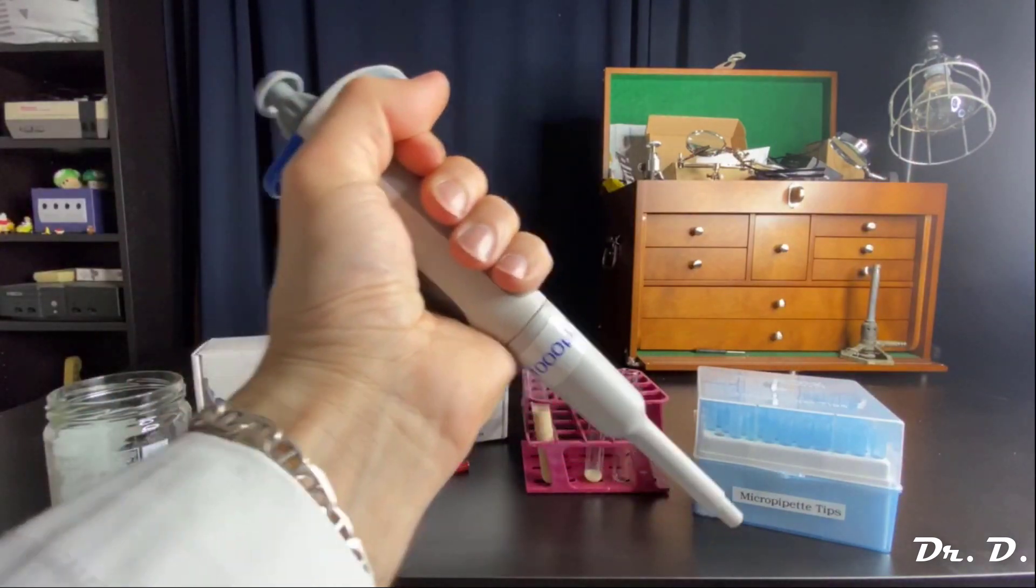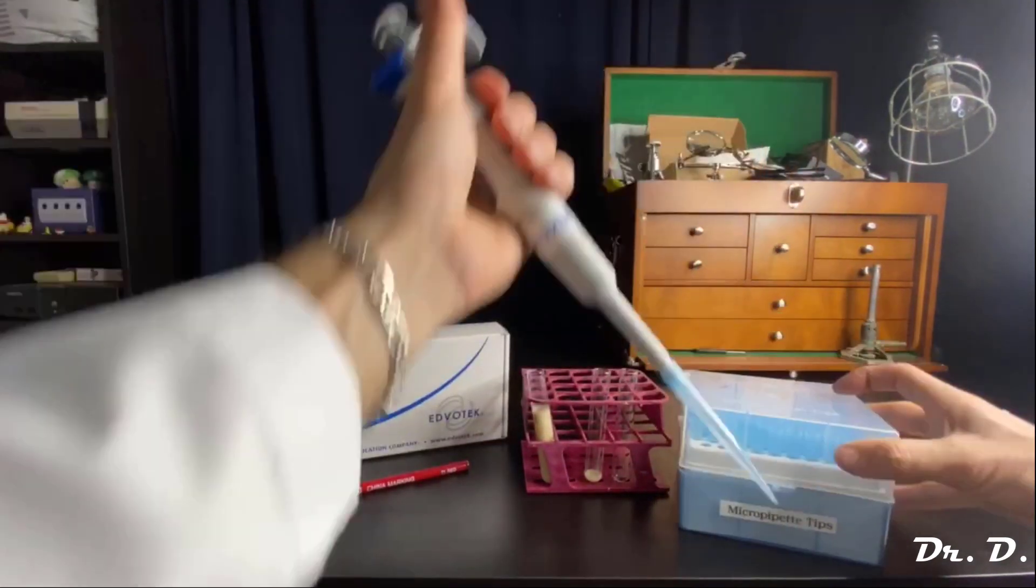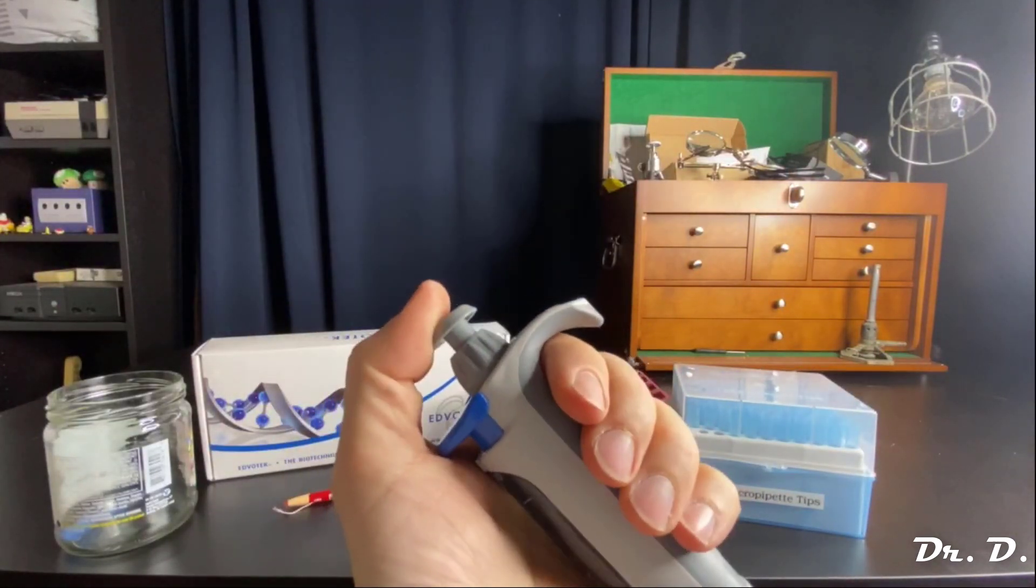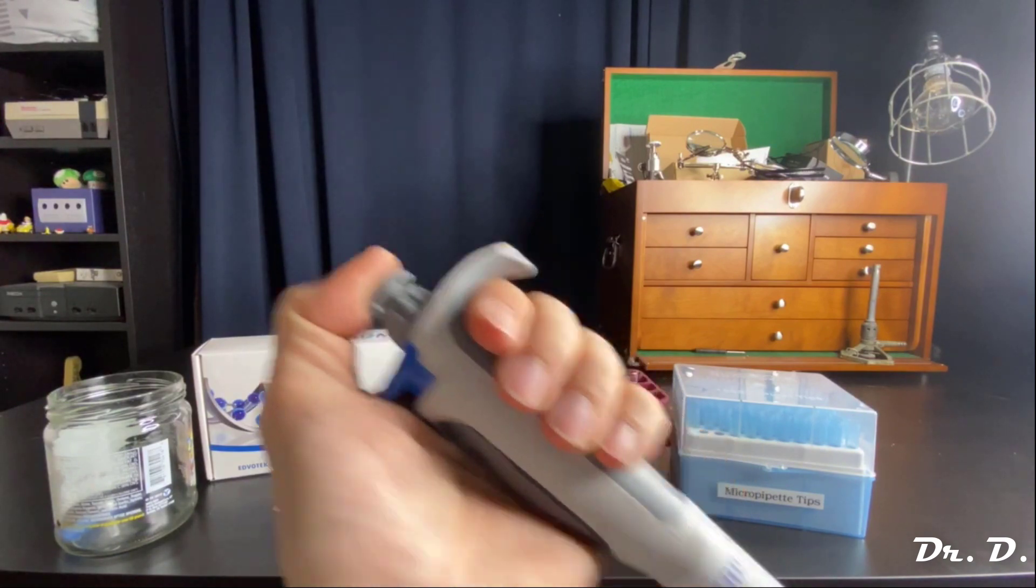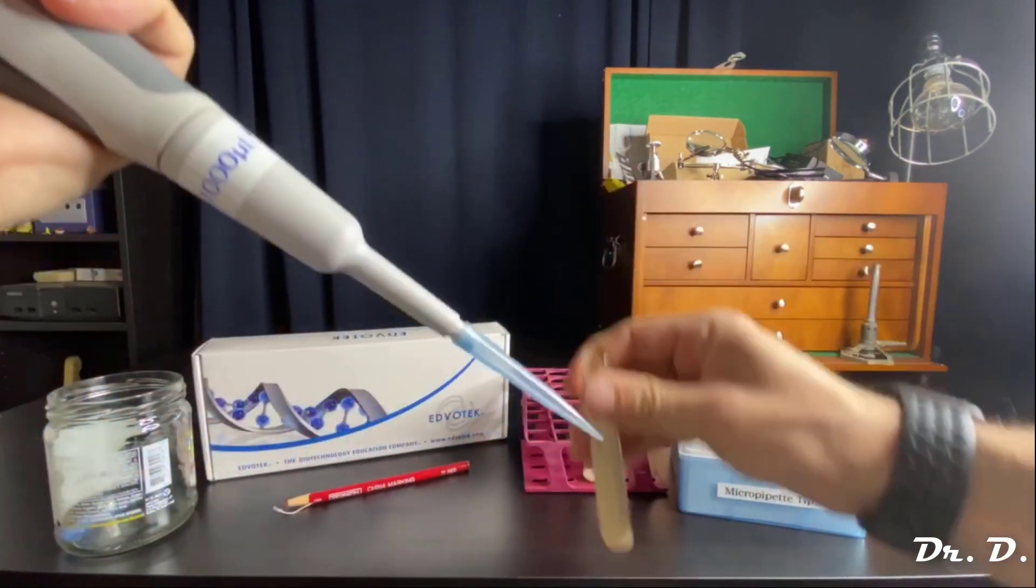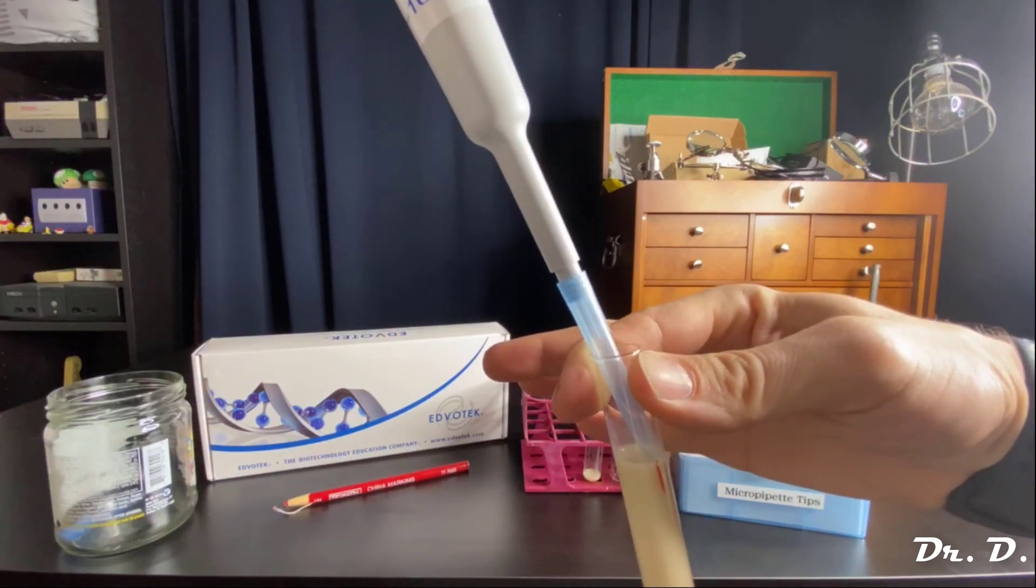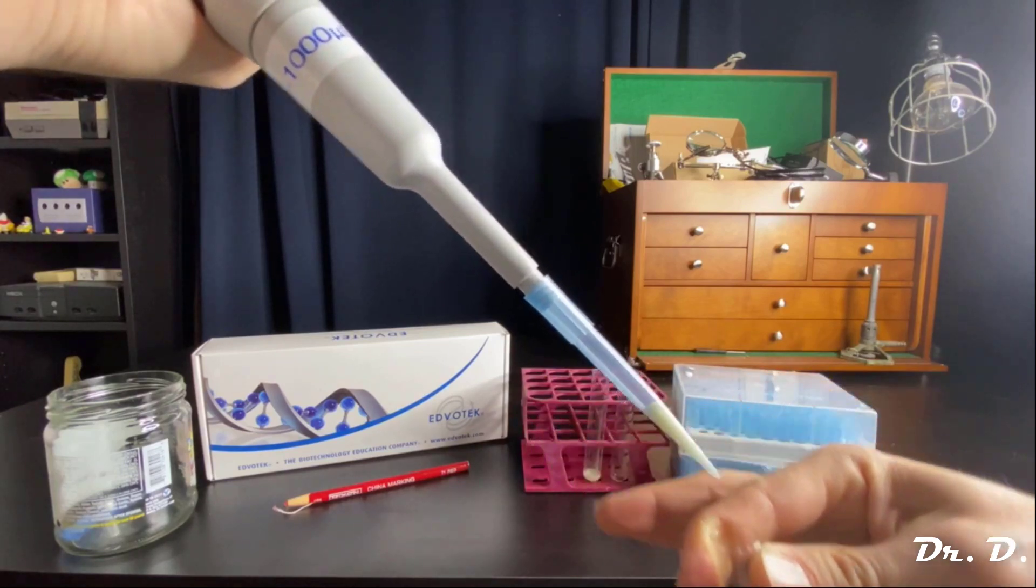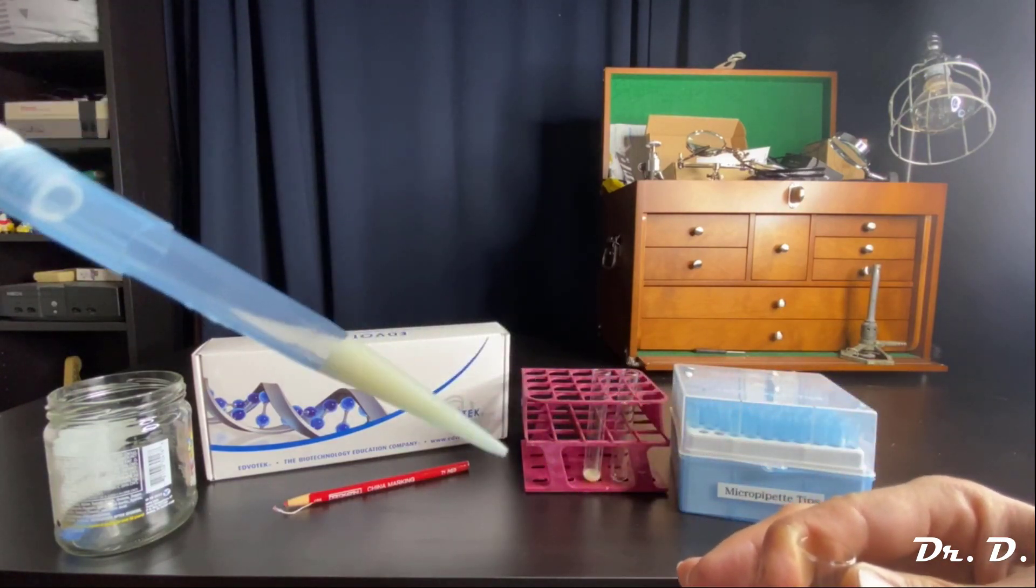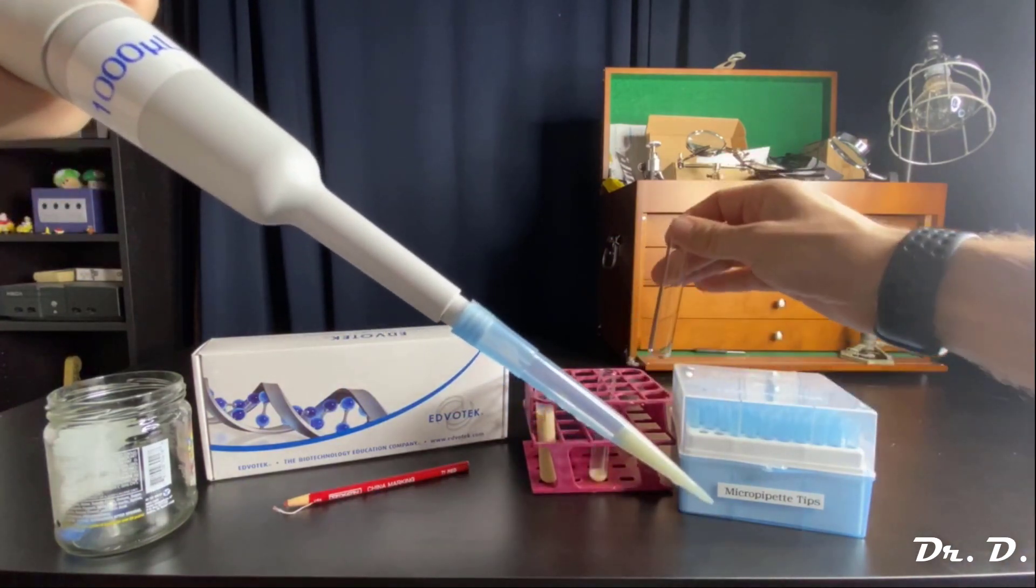Remember, at this point, I grab a tip. Got my tip. Remember, at this point, I pushed down to the first stop, not the second stop, the first stop, grab my tube, go into the solution, slowly let up on the plunger. And there you go. You can clearly see the solution in the tip. And now I'm going to aliquot that into tube three.